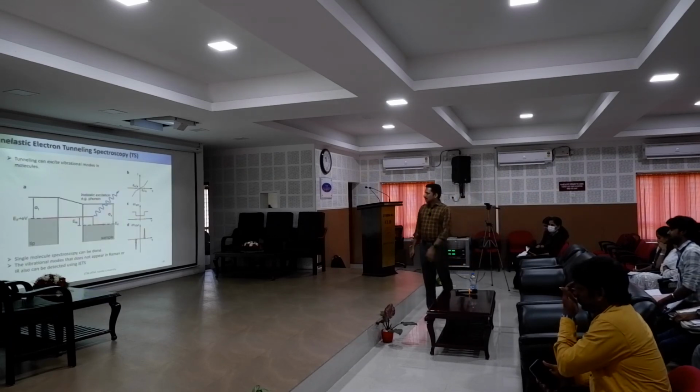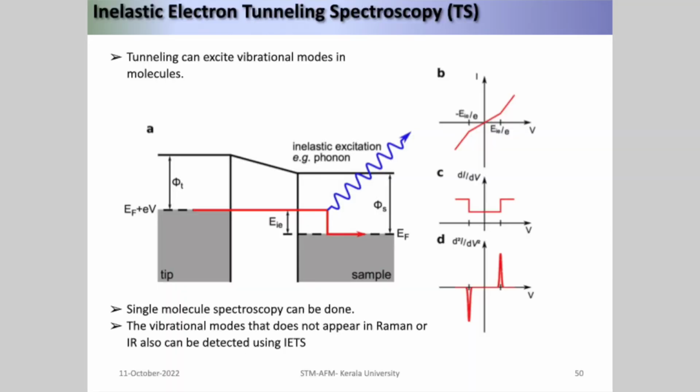Okay. Last thing. Okay. Promise. There's a very new type of spectroscopy with the STM.